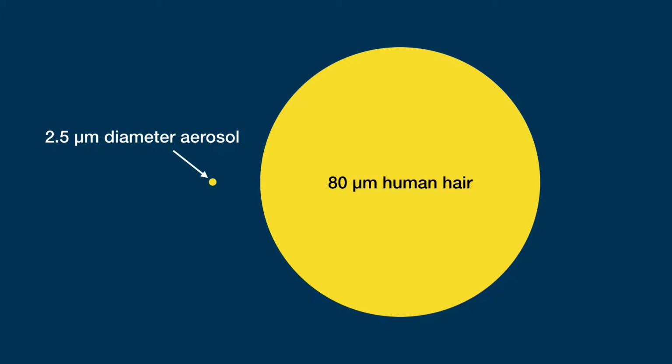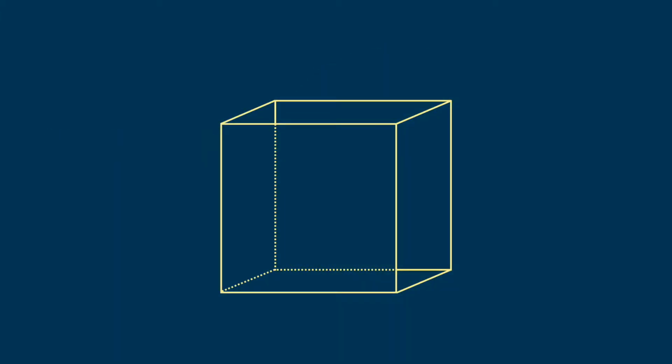The most common aerosol metric of interest is called PM2.5. PM2.5 refers to the mass of aerosols whose diameter is smaller than 2.5 microns. We are concerned with particles smaller than 2.5 microns because their health effects have been shown to be more harmful than larger aerosols. Often, PM2.5 is expressed as a volumetric mass concentration with units of micrograms per cubic meter.